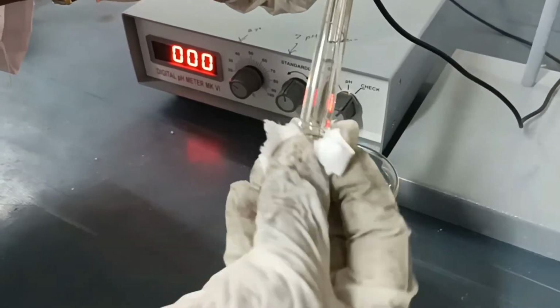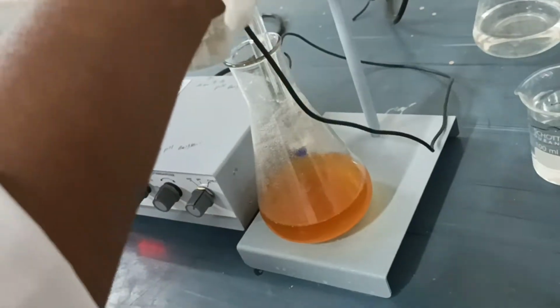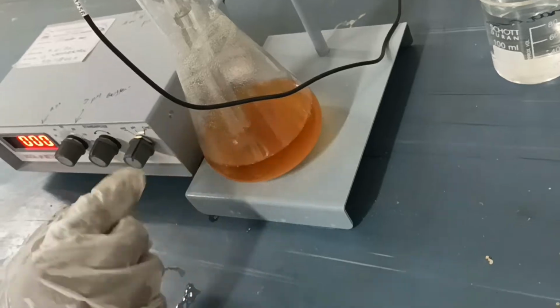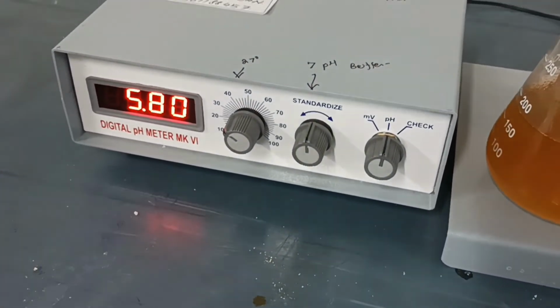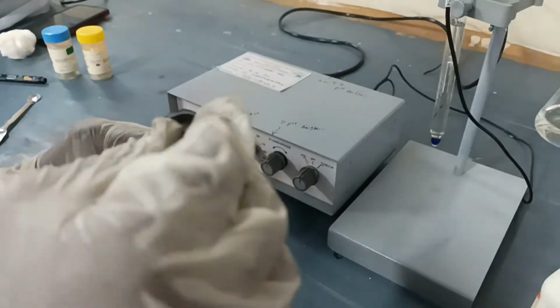Remove the electrode from the buffer solution. Wash the electrode with distilled water and dry the electrode with tissue paper gently. Now check the sample. Press the pH mode. Wait for some seconds until the reading stabilizes. In this sample, the pH is 5.8. We need neutral pH, so add 2 or 3 drops of alkali solution to adjust the pH to 7.